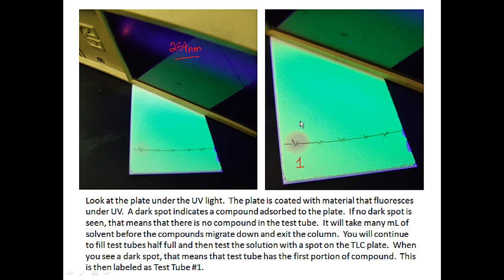But once we see that dark spot, then test tube number 1 has compound 1 eluted from the column. So from here on out, every half test tube gets spotted onto its own lane on a TLC plate.